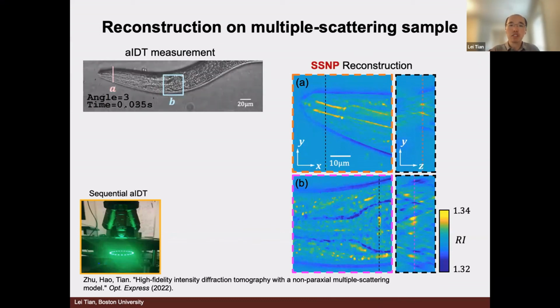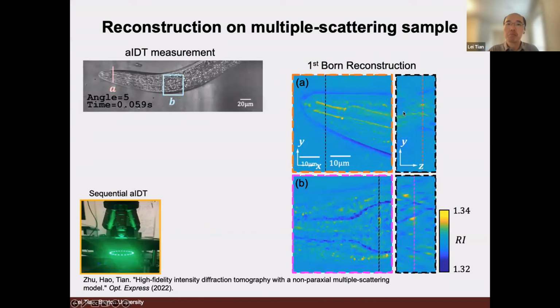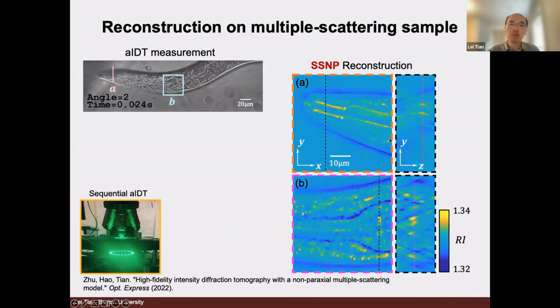It's just that their runtime is different. The first one is basically real time, on MATLAB or Python. The advanced one I'd say is fast, but it still takes a few minutes, just because intrinsically we are doing different computations.